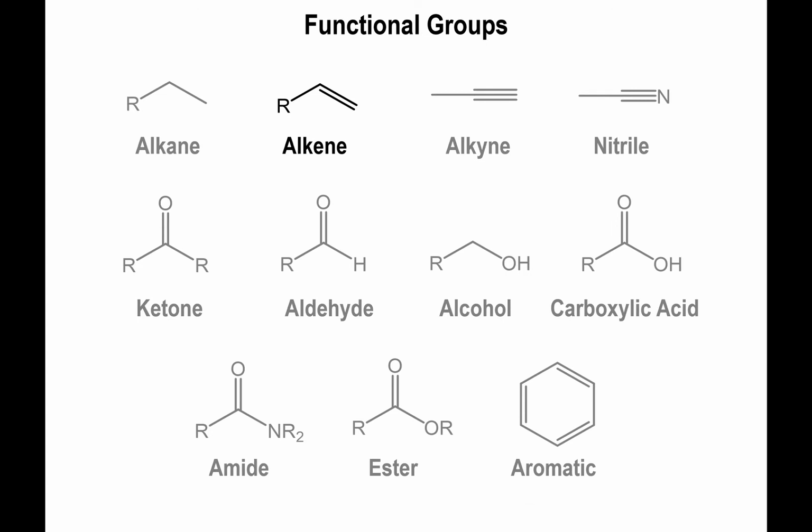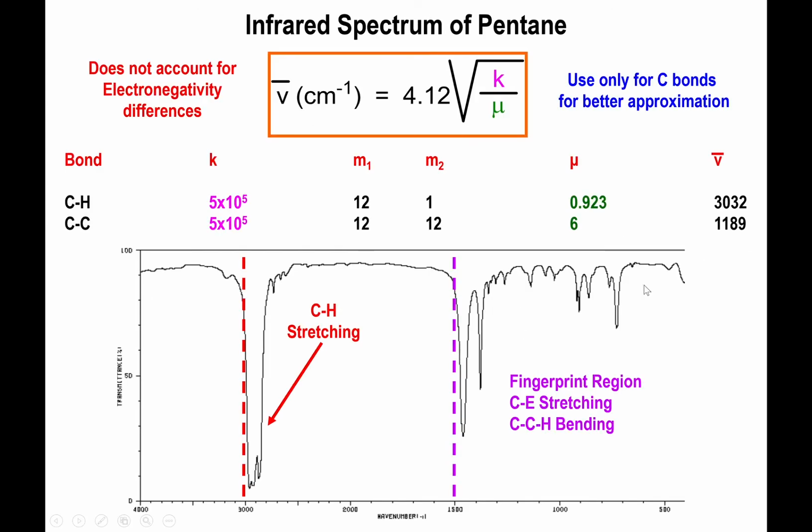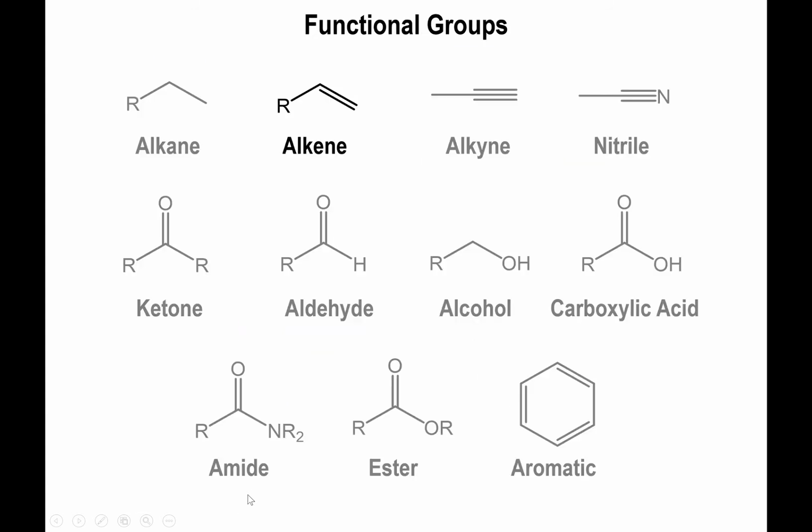But for us chemists, trying to memorize all the patterns for the specific molecules is not very helpful. So what we're going to focus on instead is the region outside of the fingerprint, the one that's more general, but that tells us with certainty that we have one particular functional group present. All right, but for now, keep in mind that pentane contains sp3 carbons, and these bonds right here are sp3 carbon CH bonds, which fall below 3000, slightly below it.